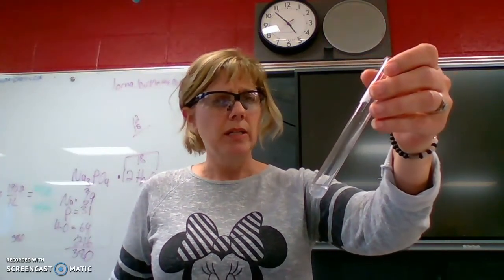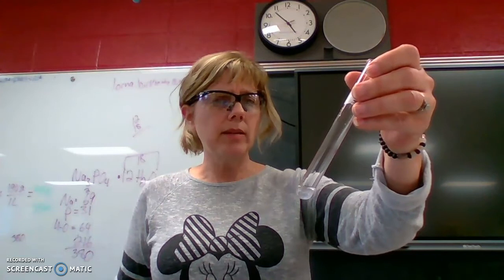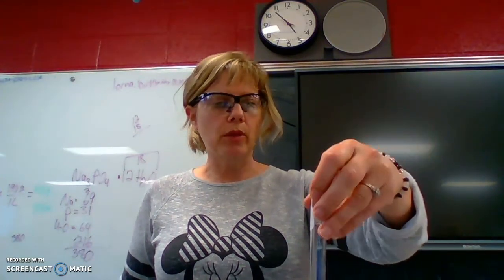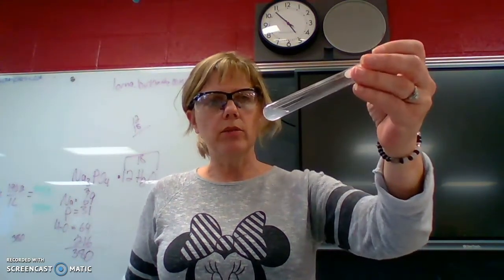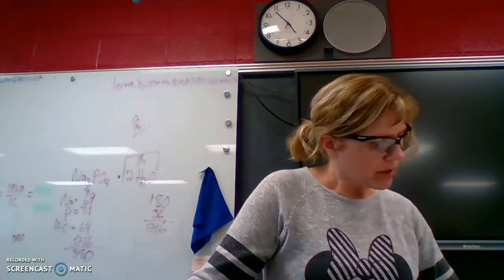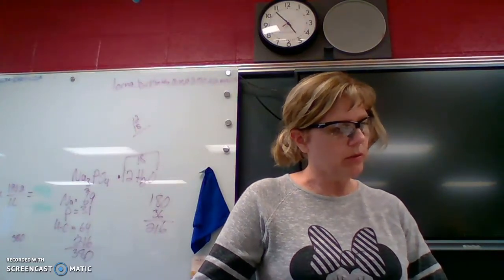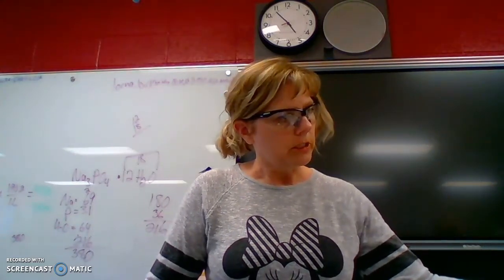so this took about 20 drops. So I had 20 drops of sodium hydroxide in here, of one molar strength, and then it took about 20 drops of one molar strength hydrochloric acid to make this not be basic or alkaline anymore. And now it's pretty clear. It looks a little more cloudy on the video than it really is. It's really pretty clear. So that was reaction number 7, was just the number of drops, and that was about 20 drops.